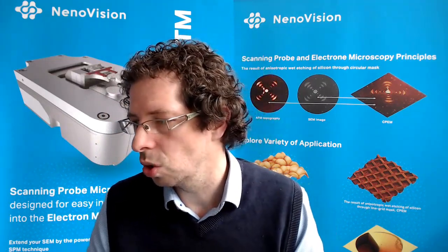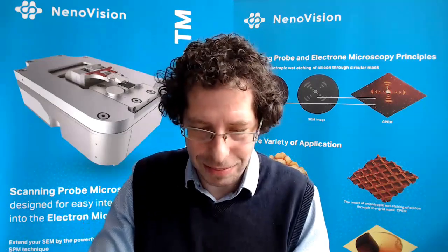One of the questions is, what exactly does in-situ measurement mean in the context of AFM in SEM? What is unique about it? In-situ means that we use several techniques together at the same time.